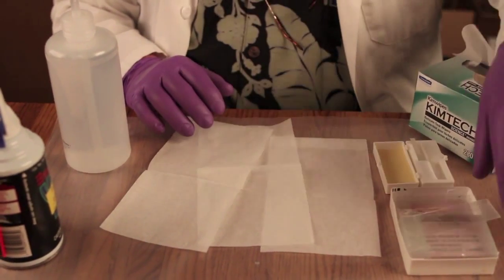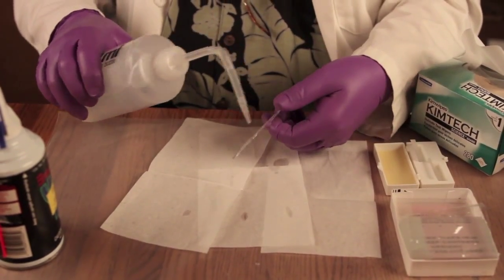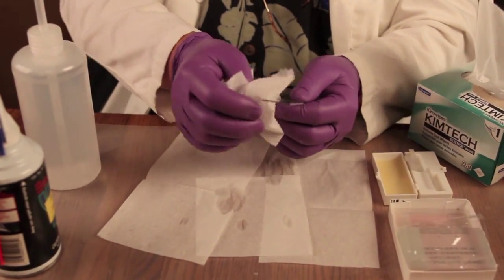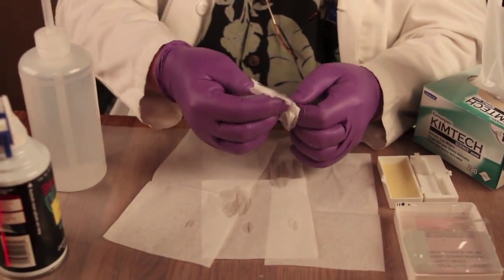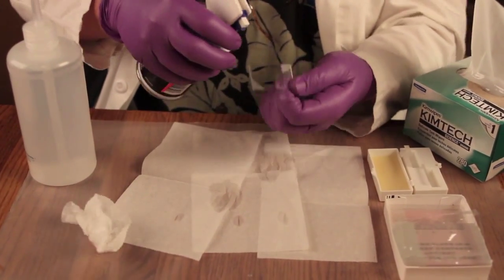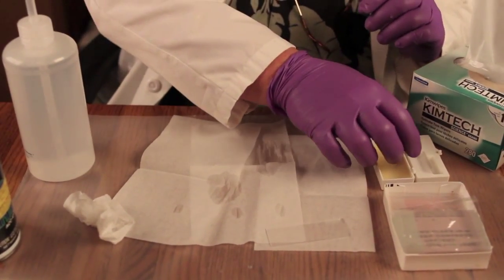It's very important that you work with clean slides. Take your slides and wash them in distilled water, spray each side, then use a Kim Wipe — Kim Wipes don't shed as much as Kleenex. Make sure it's completely dry, then hit it with some compressed air to remove any remaining pieces of material so it's nice and clean. Set it aside on a clean Kim Wipe.